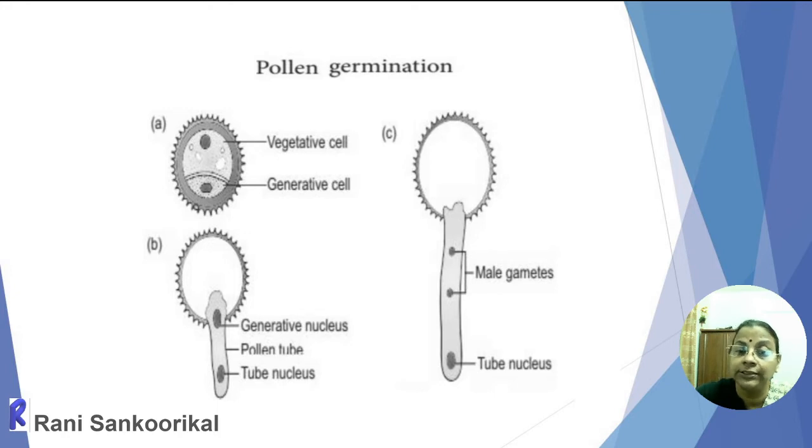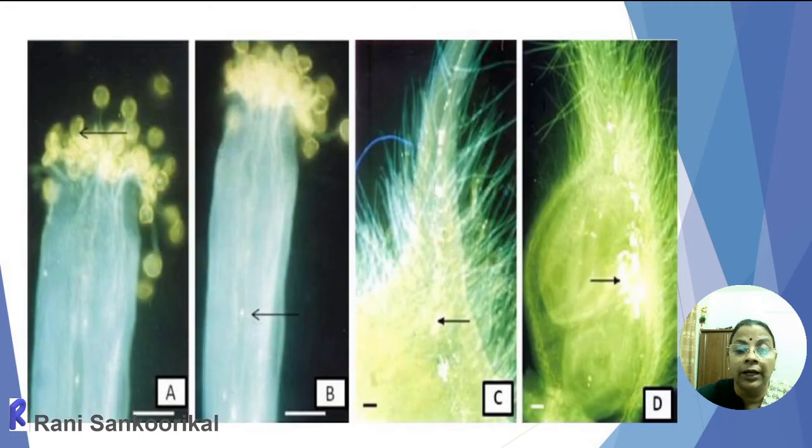So that is the later stage of development. Sometimes a figure will be given and they will ask questions related to that. Along with that, boric acid or boron is essential for pollen development. And these are the different stages of figures which we can observe through the microscope under 10x.